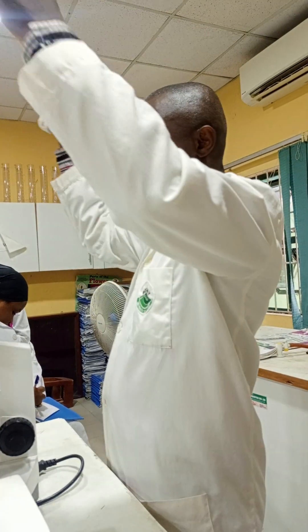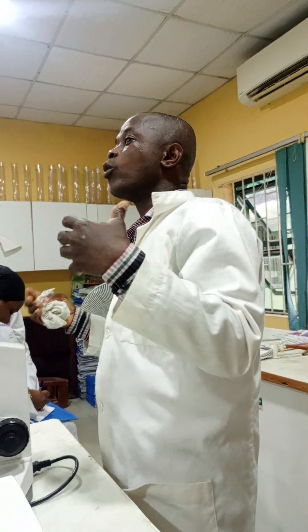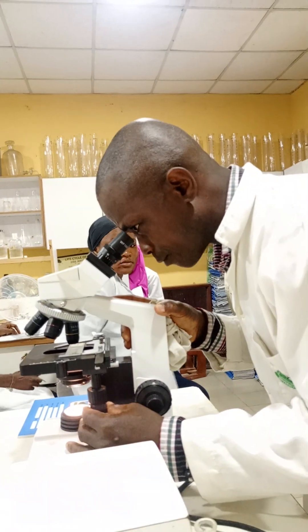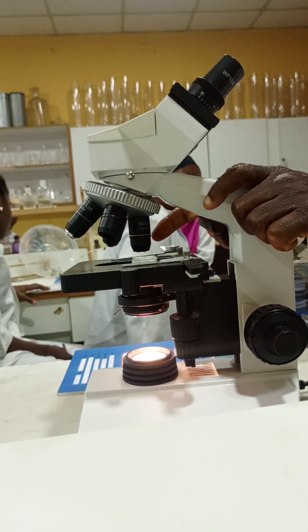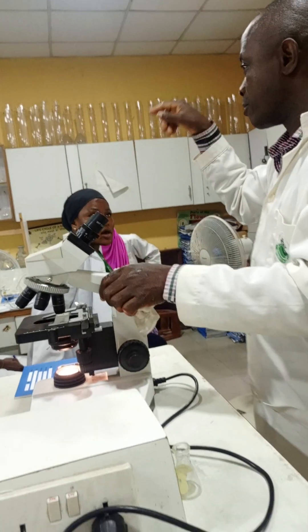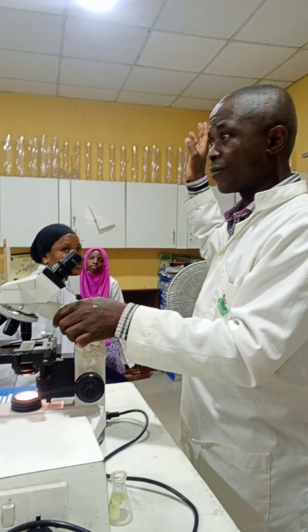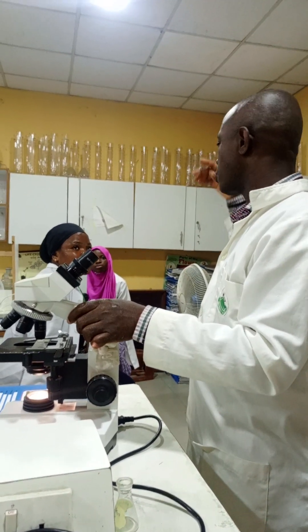Any objective lens placed directly under your specimen is the one you use to get your magnification. For example, if I have times 10 in my eyepiece and yellow band on the objective lens, my magnification is 10 times 10 equals times 100. There is no unit for magnification — it's just mag equals times 100.